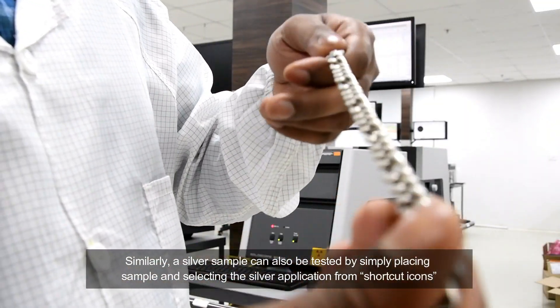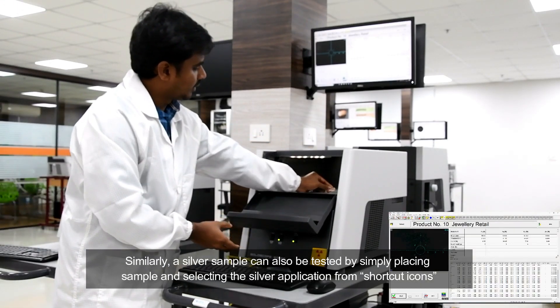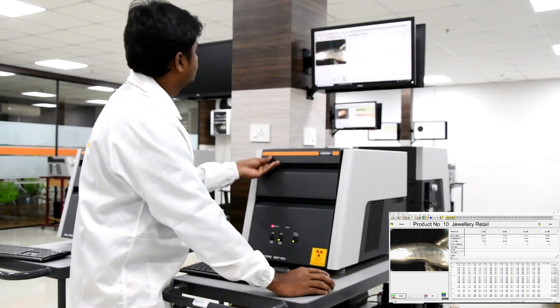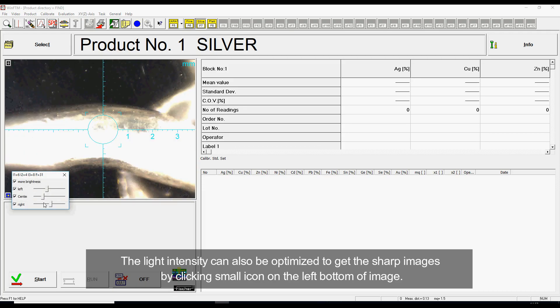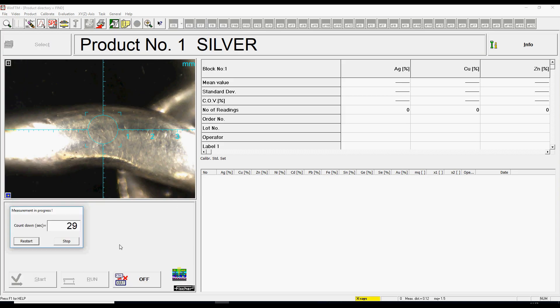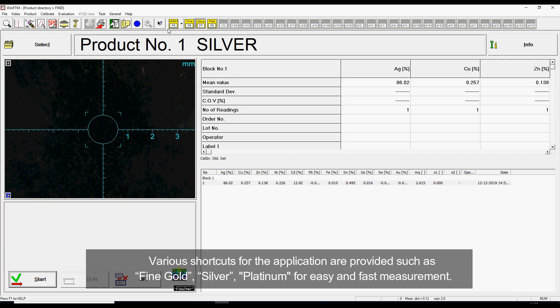Similarly, a silver sample can also be tested by simply placing the sample and selecting the silver application from the shortcut icons. Light intensity can also be optimized to get sharp images by clicking the small icon on the left bottom of the image. Various shortcuts for applications are provided such as fine gold, silver, and platinum for easy and fast measurement.